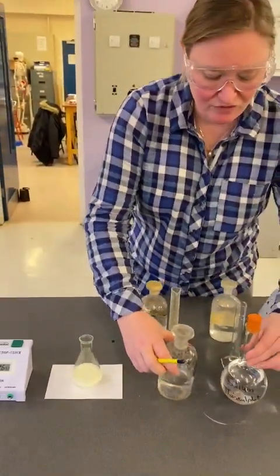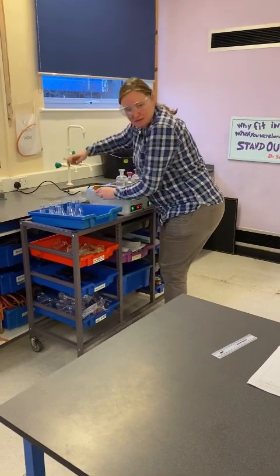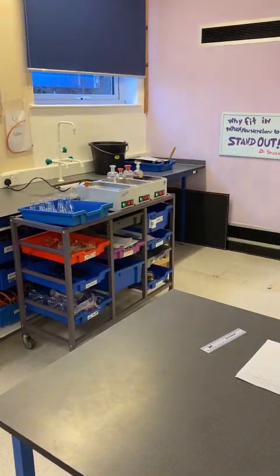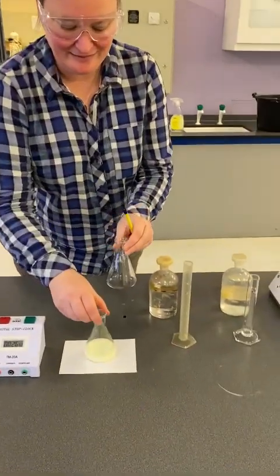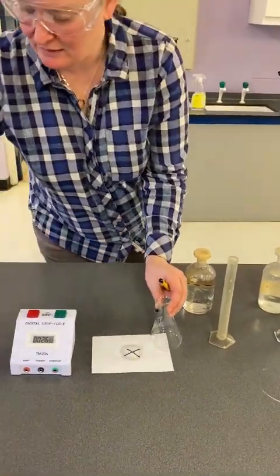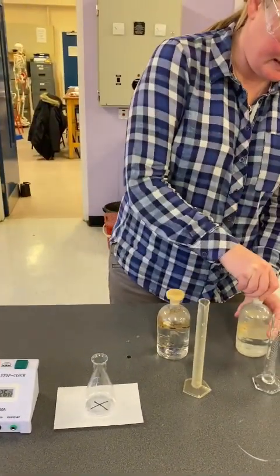I'm going to remove my room temperature ones so I don't get them mixed up. And I have a new conical flask ready here now, and repeat the experiment in the exact same way.